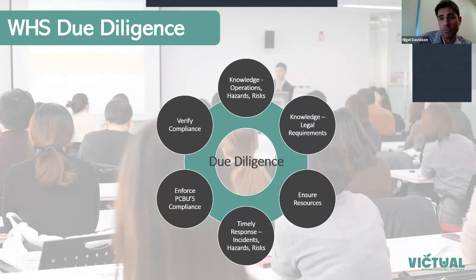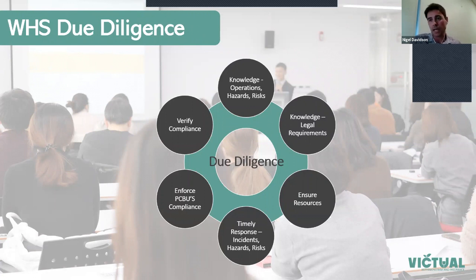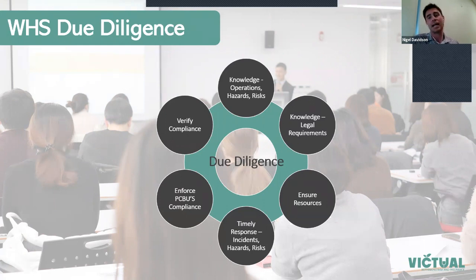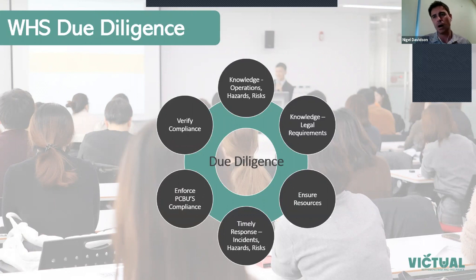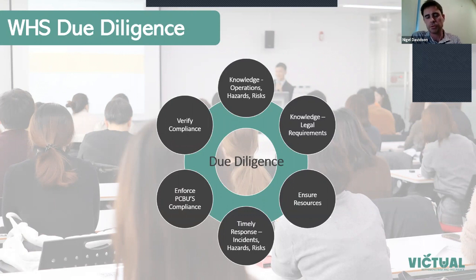Third element: ensure adequate resources — human resources, best equipment, and systems and processes for learning and improvement. Are your staff overworked or fatigued? Fourth: timely response to incidents — is your lab recording incidents, and are you actually learning from them? It's not enough to have people report incidents; you need to be learning as an organisation. Fifth: enforcing compliance — if gaps are identified, are plans in place? And sixth: verifying compliance — how much are you engaging with your workforce and work environment, doing checks and balances.